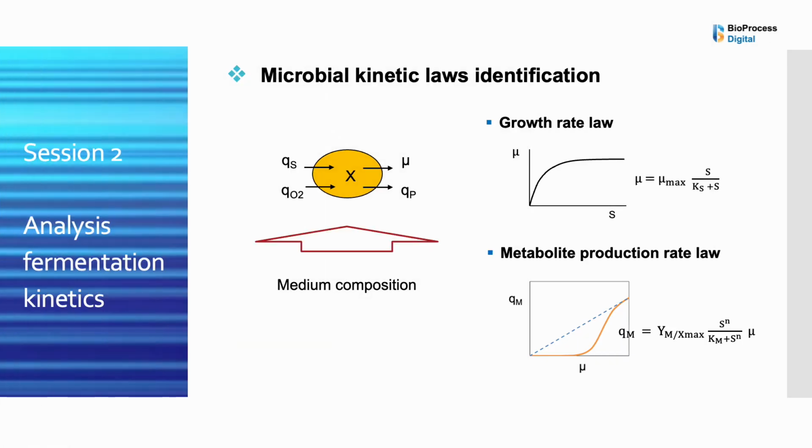In the second session, you will also identify the kinetic laws and parameters governing the microbial cells used. These laws dictate the specific rates of cell growth, metabolite production, and substrate uptake, all of which are influenced by the composition of the medium, particularly the concentration of substrates.